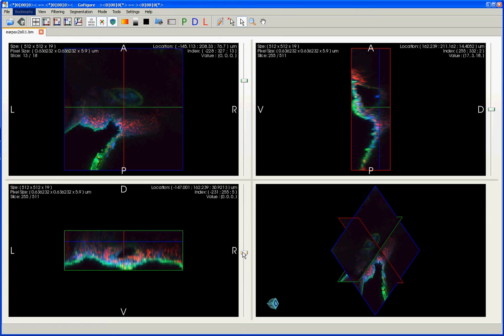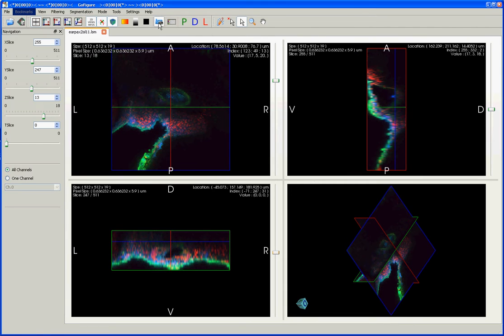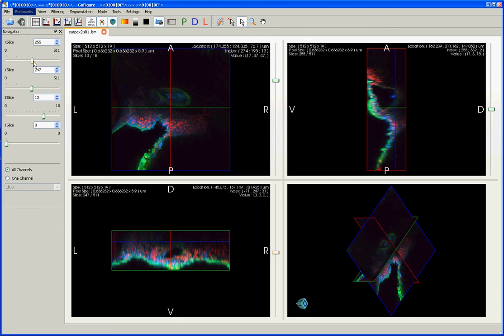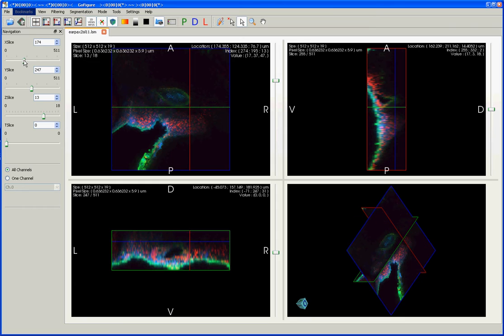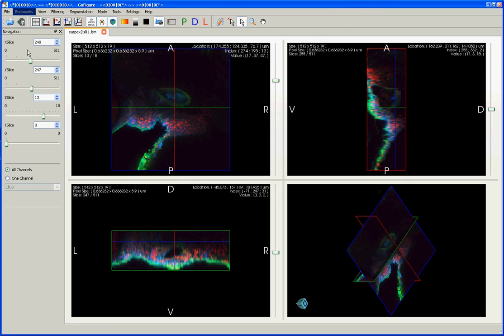If you want more precise control over exactly which slice you're looking at, it's useful to open this navigation menu using this navigation button here. It brings up this menu on the left, which still has sliders similar to the ones I've already showed you how to use. But it also allows you to directly enter in a number for the slice you wish to look at. So for instance, if I already know that there's some feature I'm interested in at X slice 240, I can type that in here, and you can see that reflected in the views on the right.